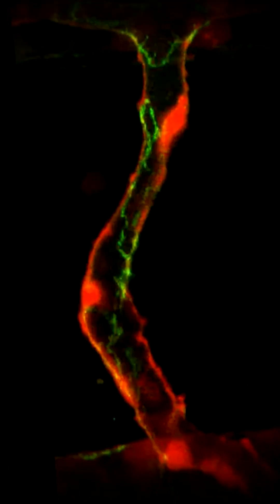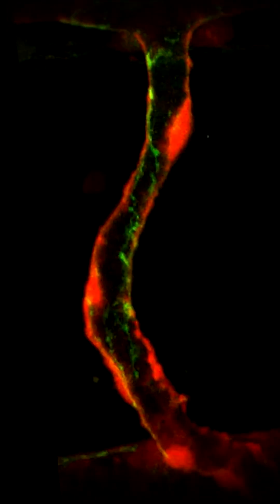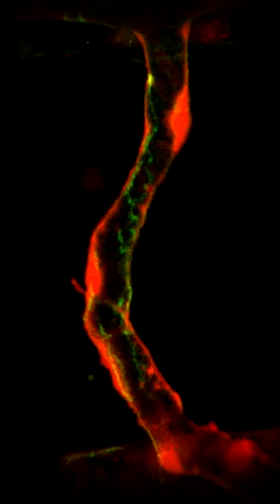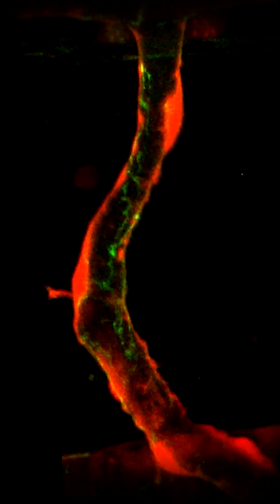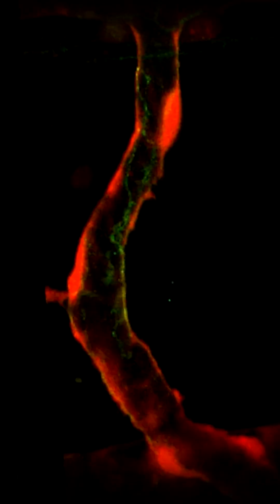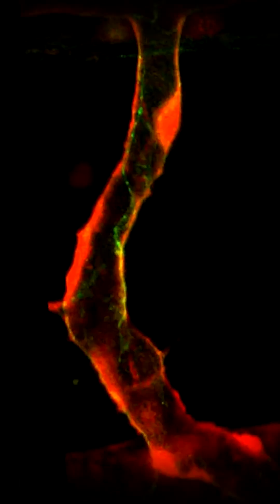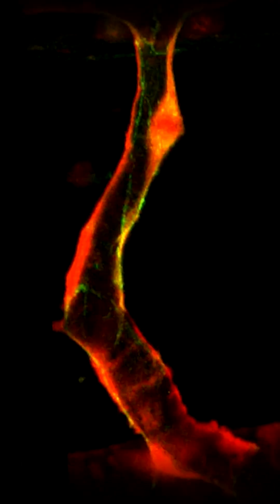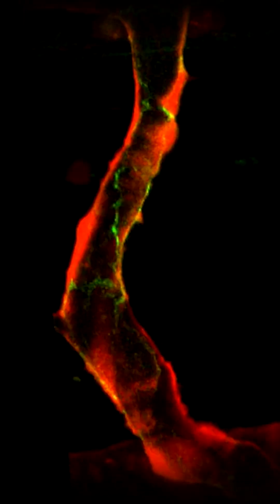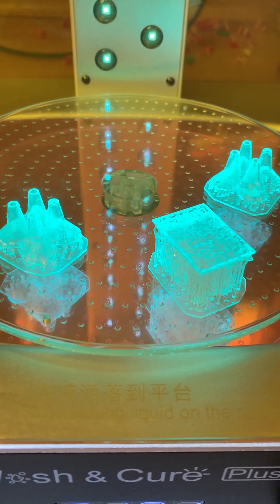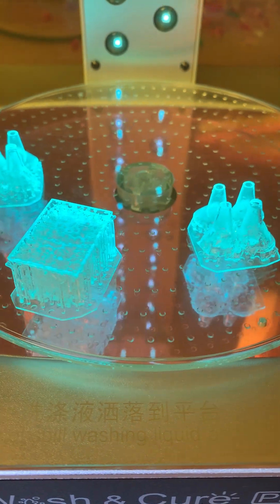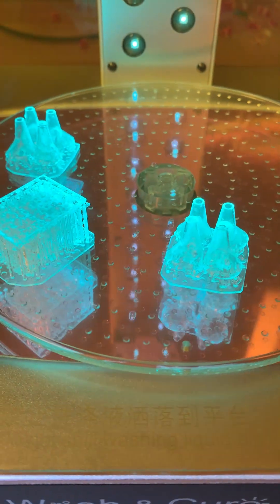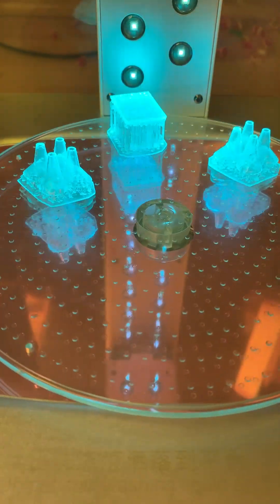These are fluorescently labeled endothelial cells forming a vessel and growing in a lab on a chip model. Recently I talked about applications of 3D printing in a research lab, and these were the three models used to create a lab on a chip.